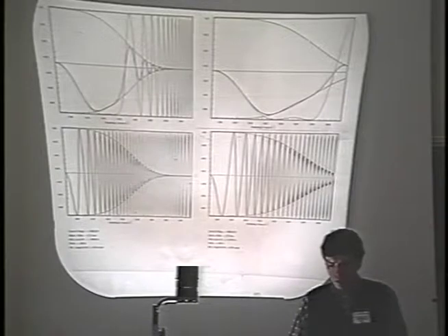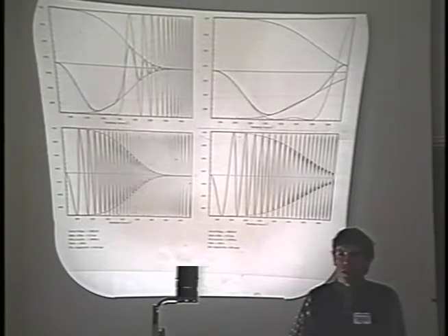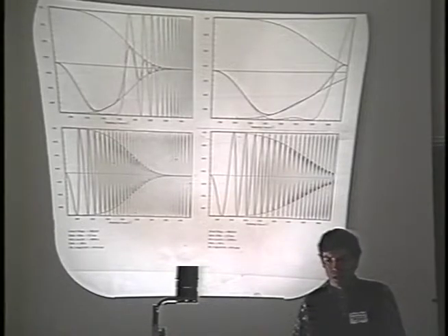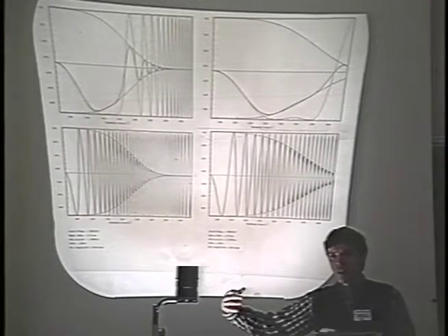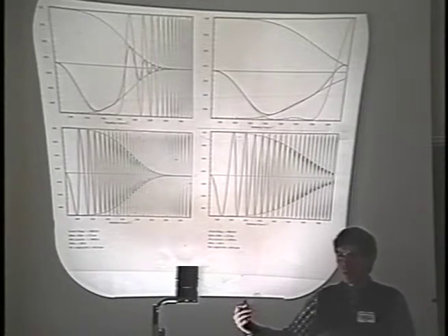Inevitably, I believe that the grid in the microscope undergoes a certain amount of vertical motion. How much motion is an open question, but there probably are cases where that's a real limitation, particularly in the case of cold stages, where there's not only a little bit less mechanical rigidity than the normal stage, but it's also out on the end of a specimen exchange rod sitting in some position that really looks quite precarious.